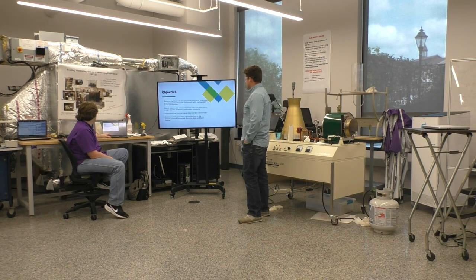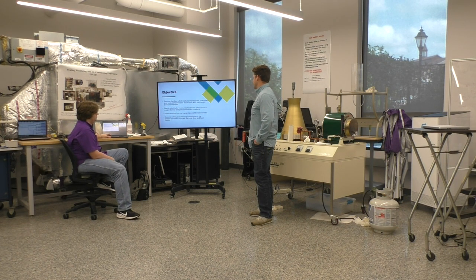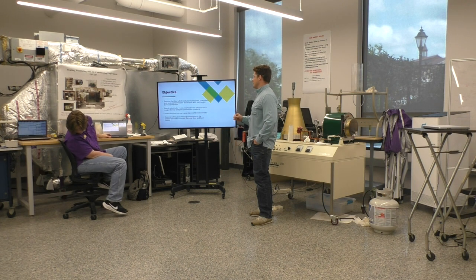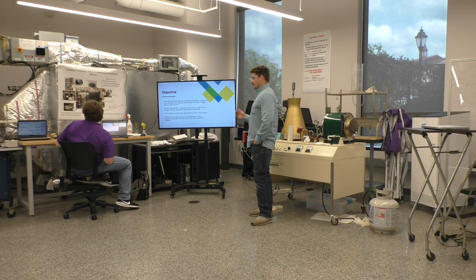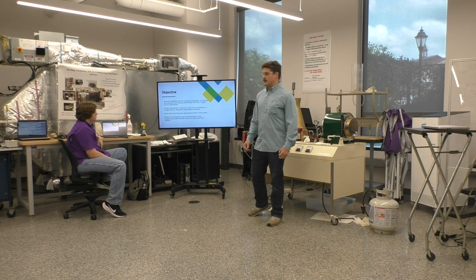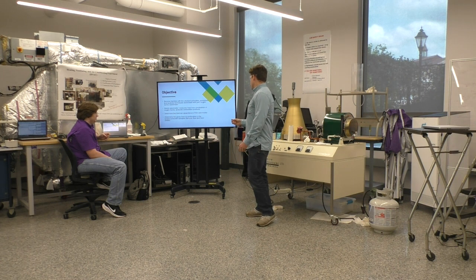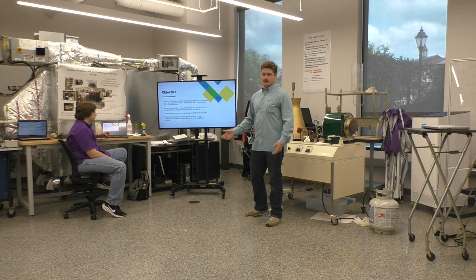So, our objective is to become familiar with the physical principles, procedure, and analysis techniques associated with the oxygen bomb calorimeter. Like I said just a minute ago, the bomb calorimeter is going to measure the heat from our combustion in the oxygen bomb and analyze the combustion products. Same thing. We're going to ignite something and then measure the heat that just came off of it. So we'll determine the thermal capacitance of the calorimeter as well, and determine the gross heat of combustion from the known and unknown samples, so sour Skittles and benzoic acid.